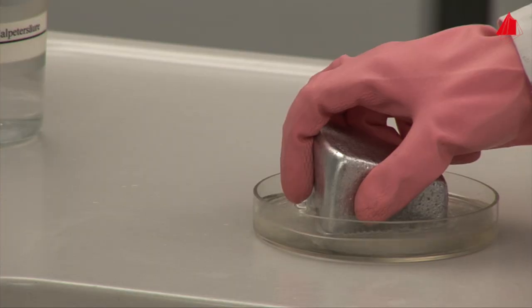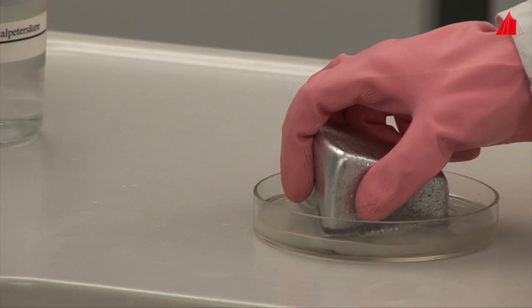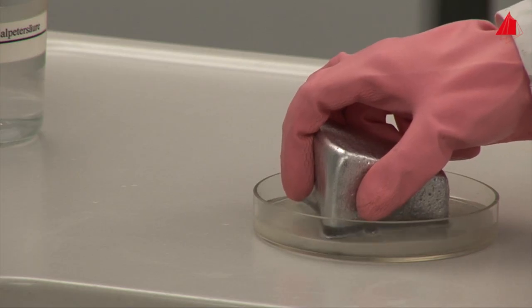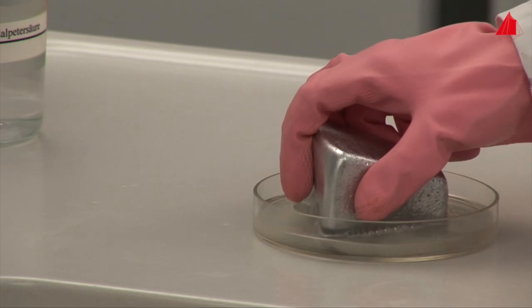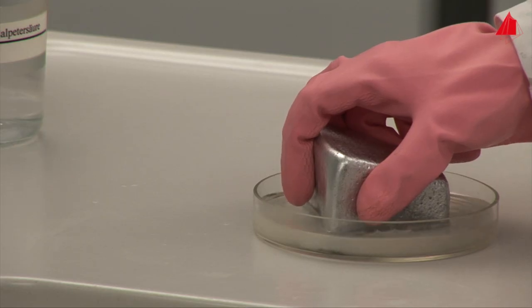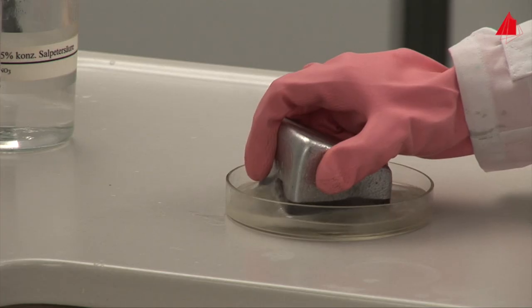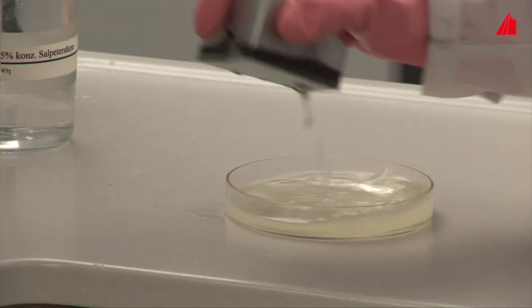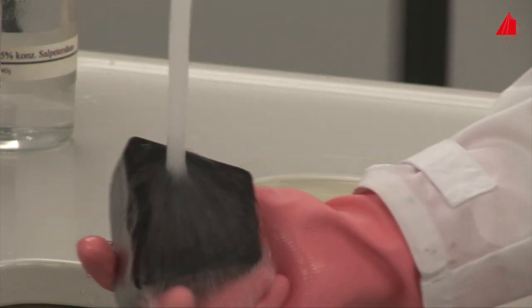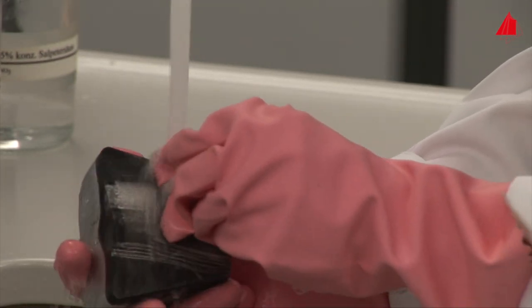After washing and drying the sample, the material tester dips the ground surface into a suitable etchant. In this case, the etchant consists of a mixture of different acids. Special care should be taken here. The material tester protects herself with a lab coat, special gloves and safety glasses. After half a minute of contact time with the etchant, she washes the sample thoroughly with water and gently wipes off the grey coat of particles using cotton wool.